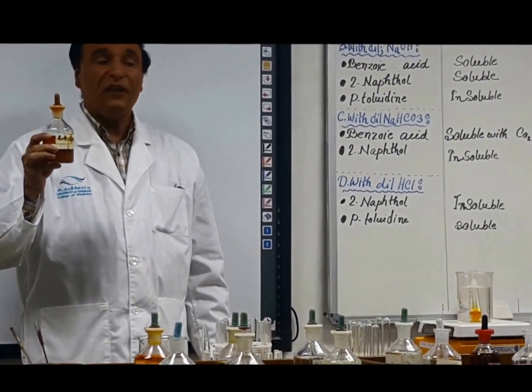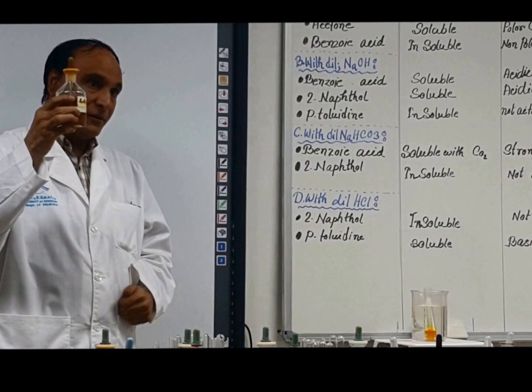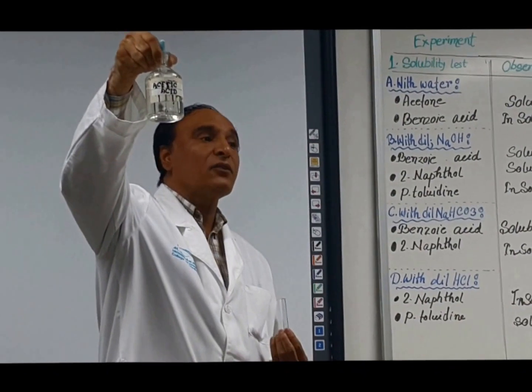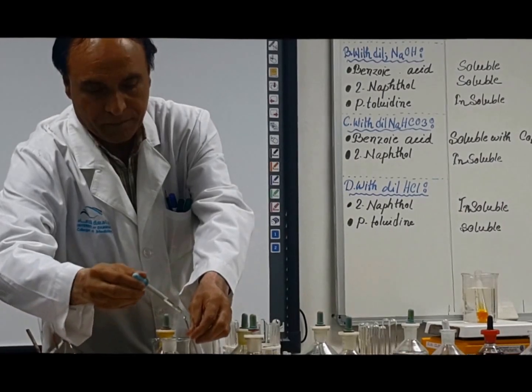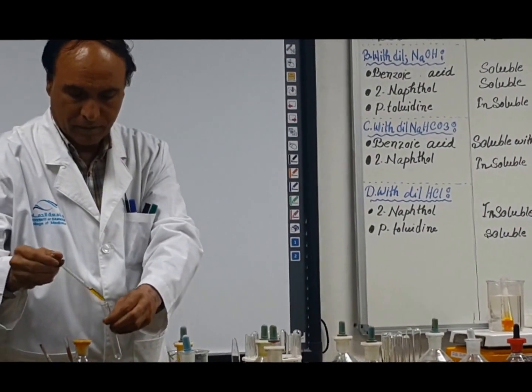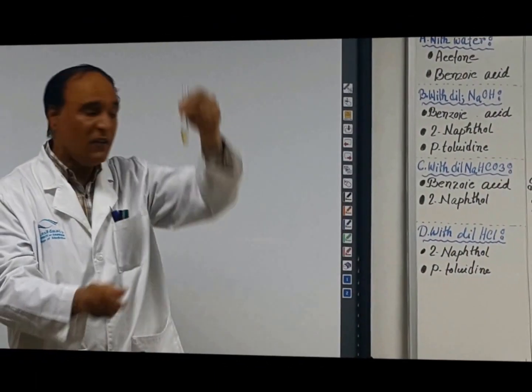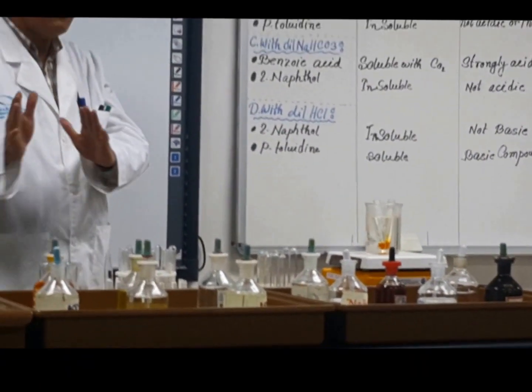Carbonyl. If, for example, I have a carboxylic acid, will it work? No, it will not work. I can show you with acetic acid. Acetic acid means ethanoic acid. So if I take the ethanoic acid and put it into it, look, there is no reaction, and there will be no reaction, because this is not for the acid. Even if I heat it, there will be no reaction. Okay? Because one reagent is for one family only.